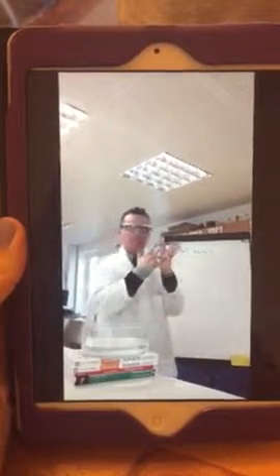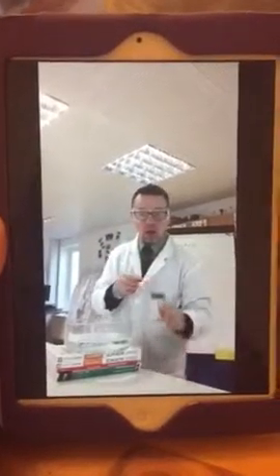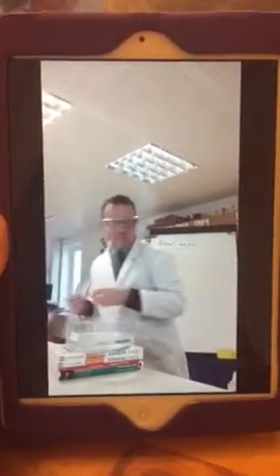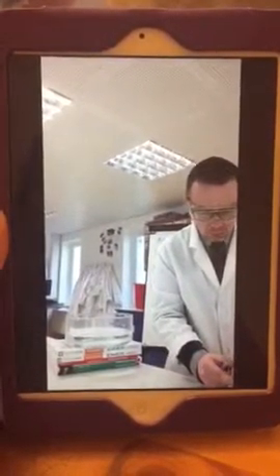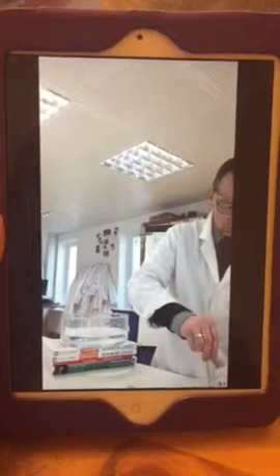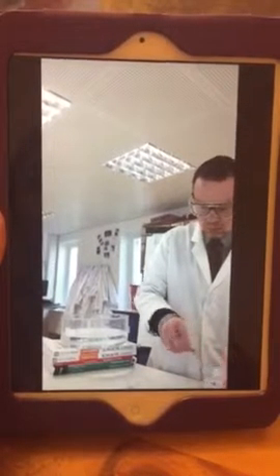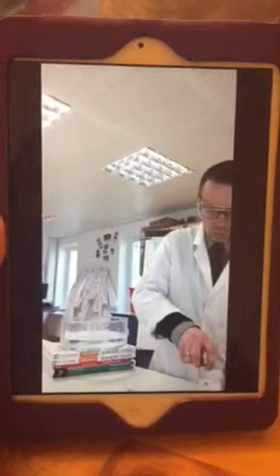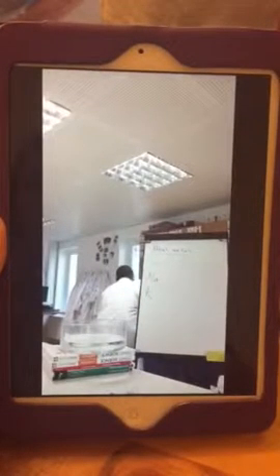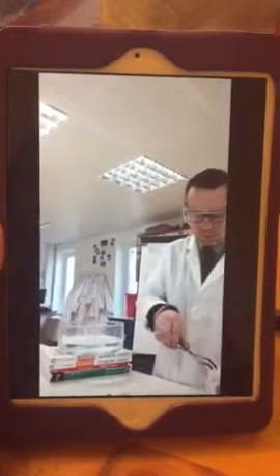So these are the chemical symbols for the metals we'll be looking at. Firstly, we'll get lithium out. This is the lithium inside this jar. We'll get it out and have a little look at what it looks like. Seems to be a bit fiddly. Okay, we're having one slight problem, but hold on a second. These are better suited for the job.